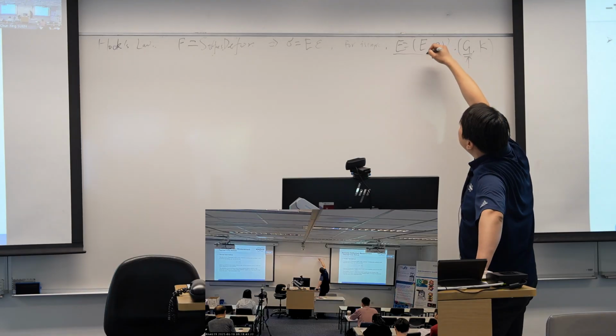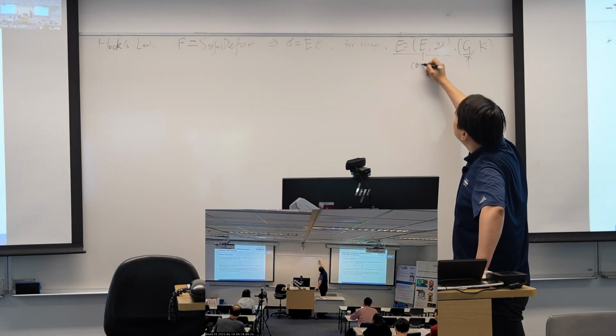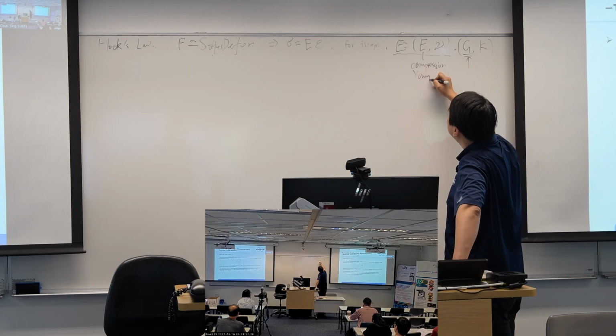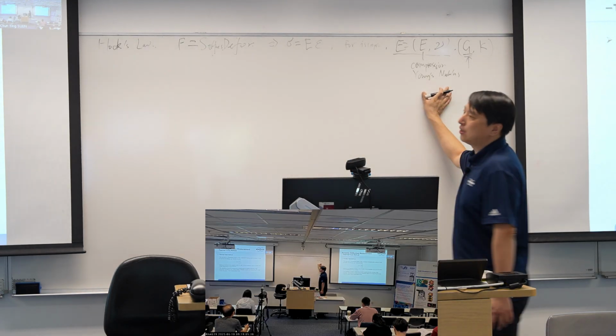Okay, and the modulus we used in this description is for compression. And for the compression, we would give it a name, it's Young's modulus. So in our study, we try to get the Young's modulus of our sample.